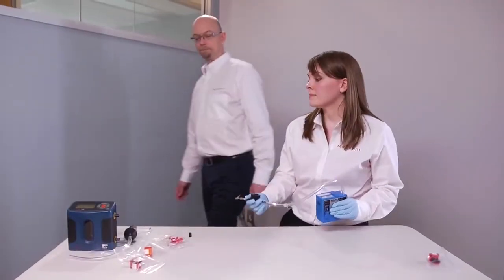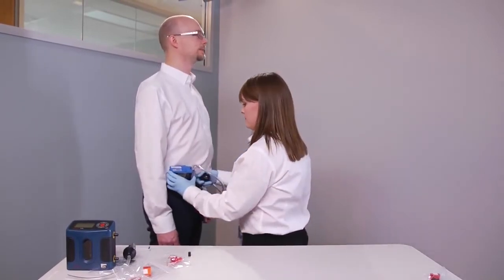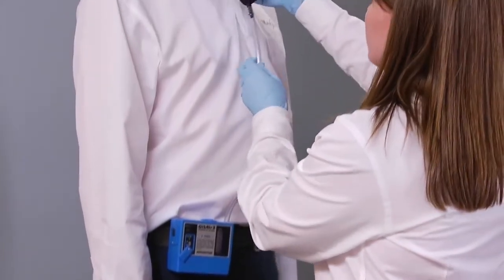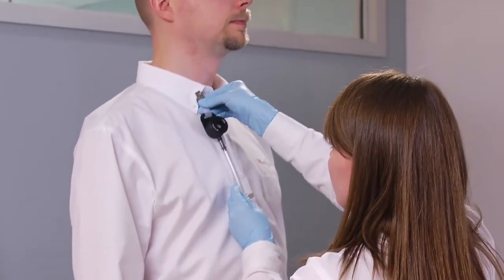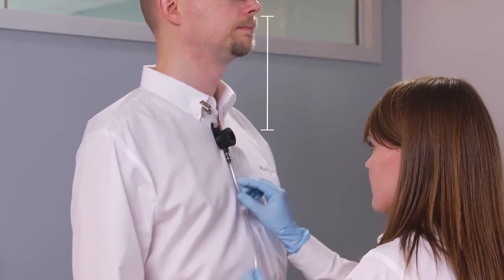As usually done for an industrial hygiene sample, clip the sampling pump securely onto the belt of the employee, minimizing interference with the work activities. Then using the sampler clip, attach the IOM sampler in or near the employee's breathing zone.